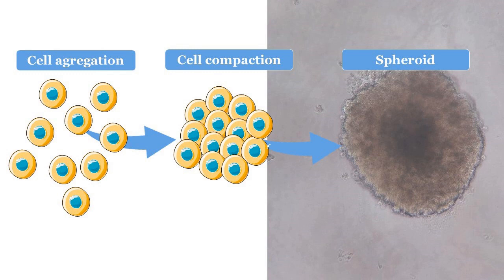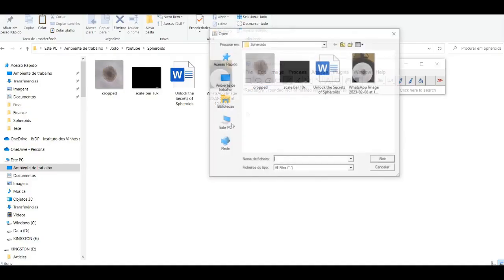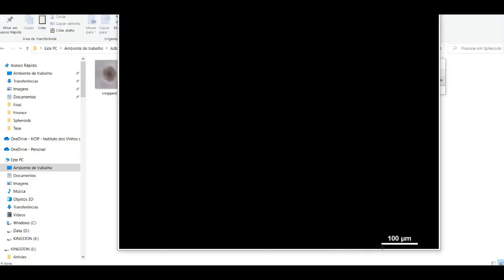In this tutorial, we will go over the steps to measure the diameter and area of spheroids using ImageJ software.